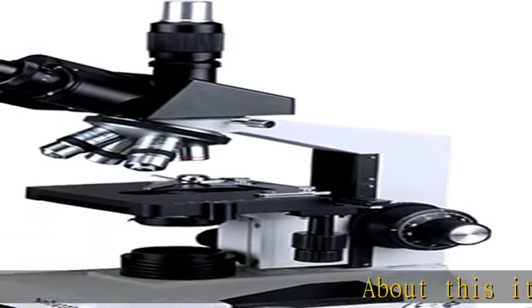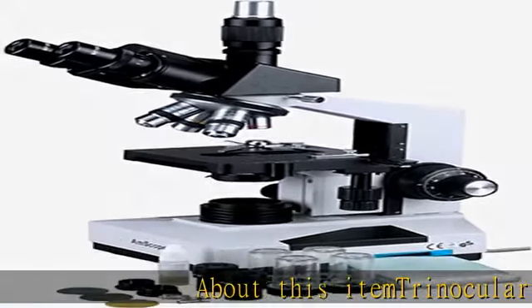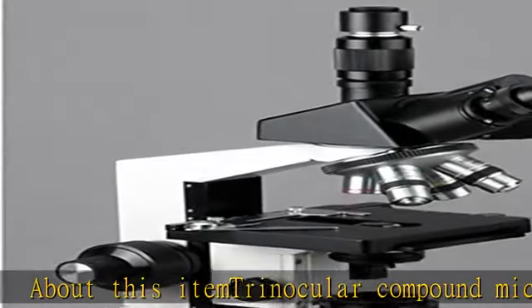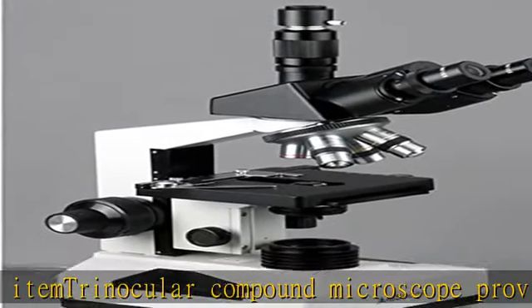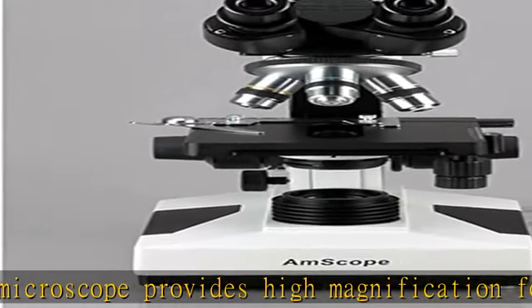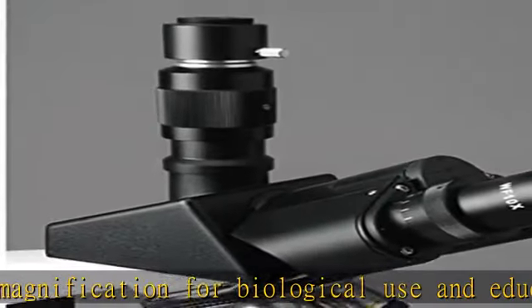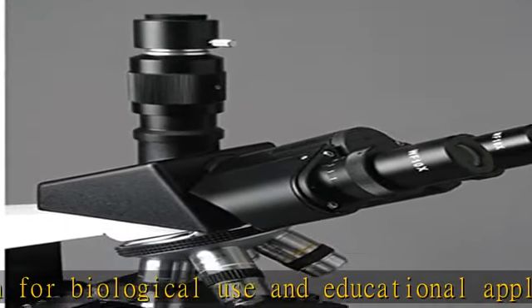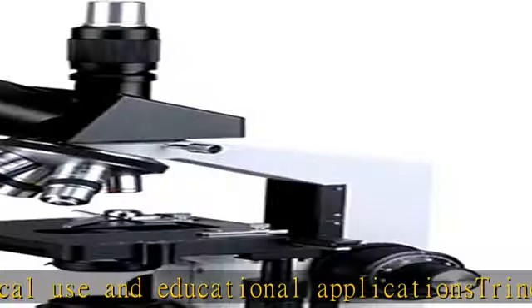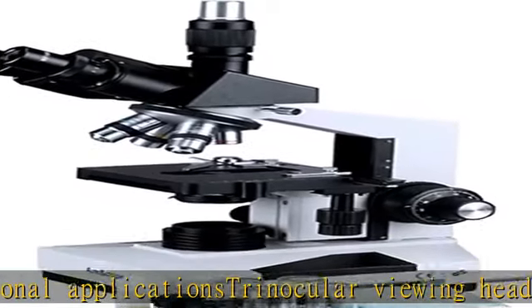About this item: Trinocular Compound Microscope provides high magnification for biological use and educational applications. Trinocular viewing head with vertical camera mount and simultaneous binocular mount with pair of 10x wide field eyepieces and sliding head with 55 to 75mm interpupillary adjustment, fixed 30 degree vertical inclination to reduce eye and neck strain.